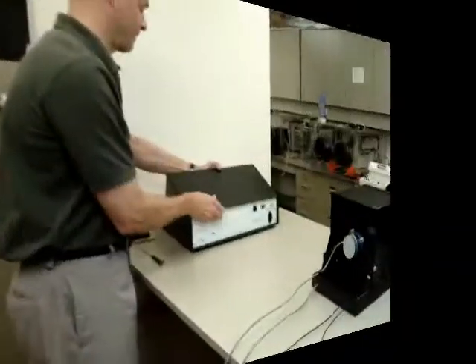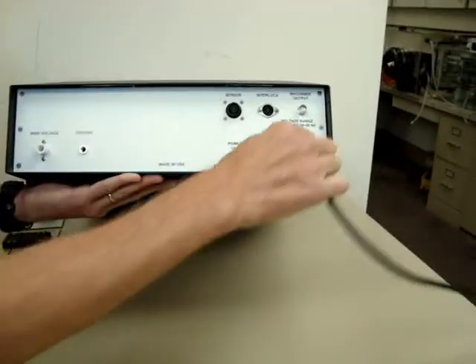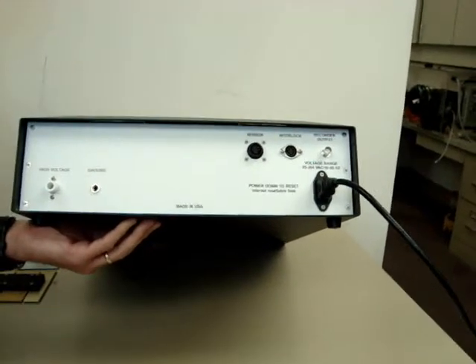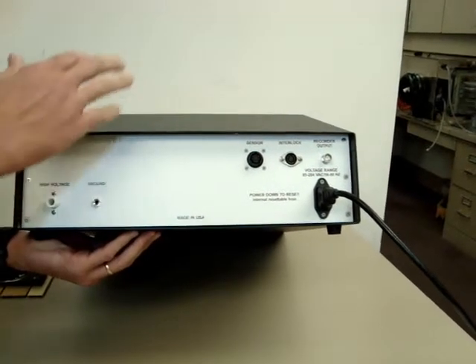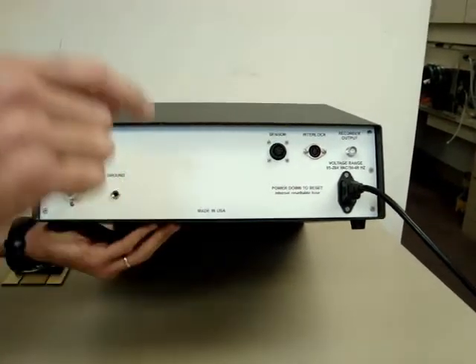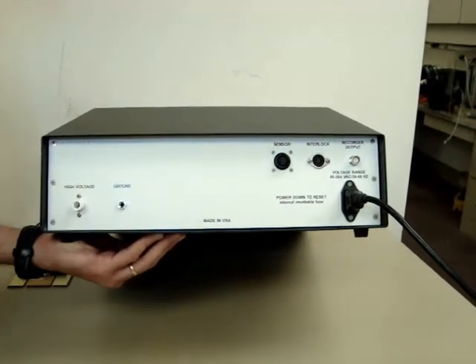First, we're going to plug in the cables, starting with the power in. One thing to mention about the power in is that there's an internal resettable fuse. If there's a power surge and the power inside the unit cuts off, you need to turn the power off, wait 20 seconds or more, then turn the power back on and the fuse is reset.